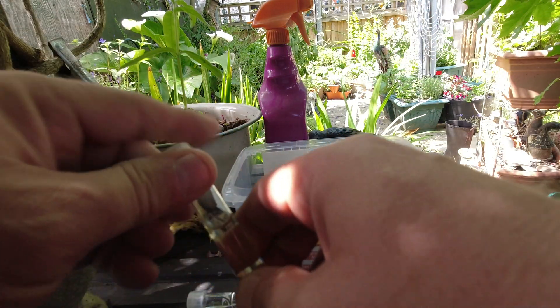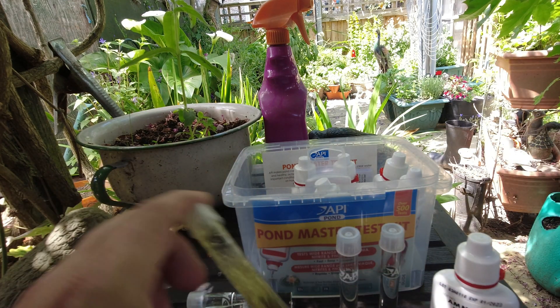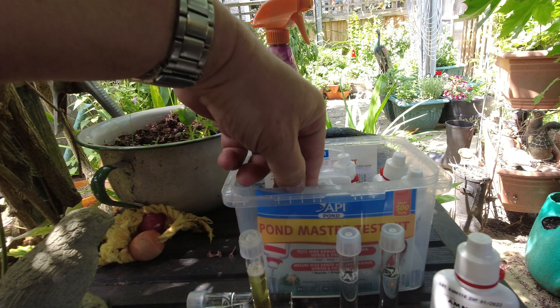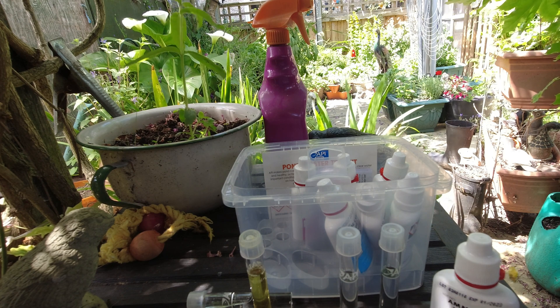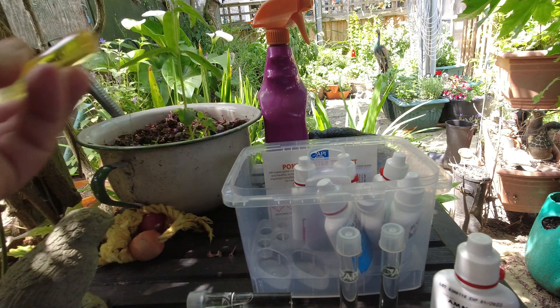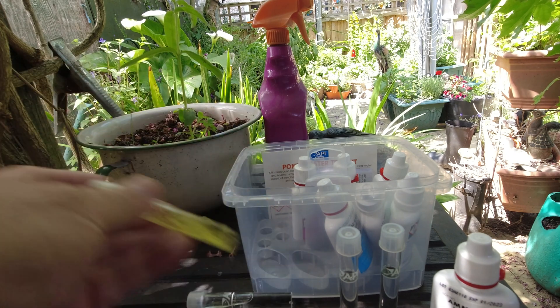We'll put the cap back on the test tube, give it a little shake, and then check the instructions. For the ammonia test, you need to give it five minutes for the color to develop. So while we're waiting for that, we'll carry on with the rest of the tests.